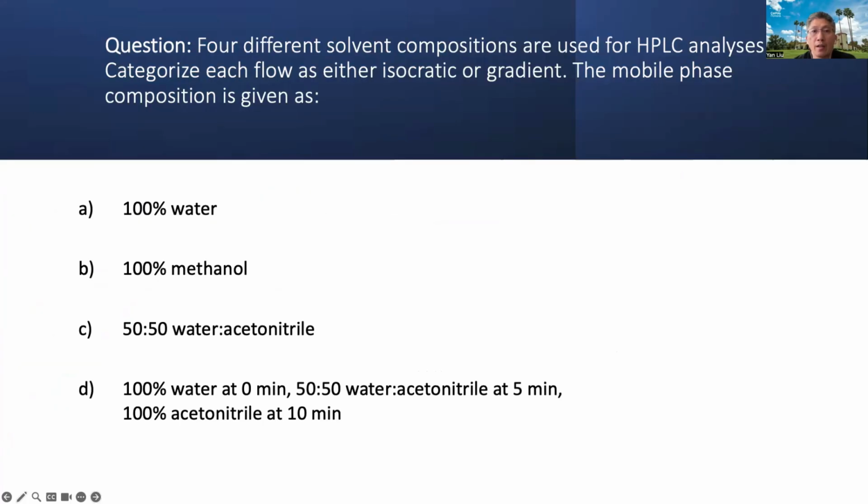Now we can look at a few examples here. Please determine if any of the examples uses isocratic or gradient run. You may pause the video until you have all answers.